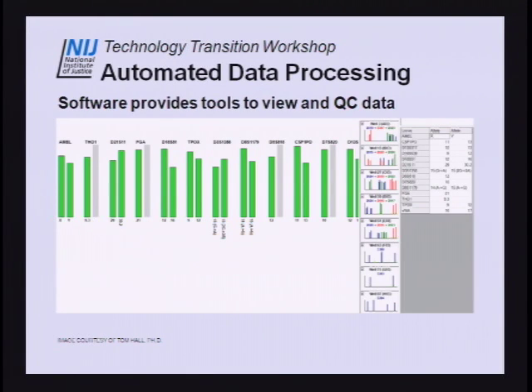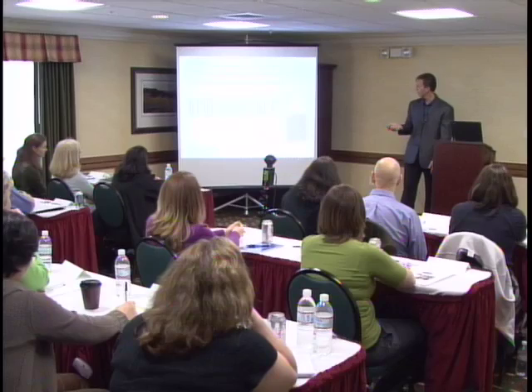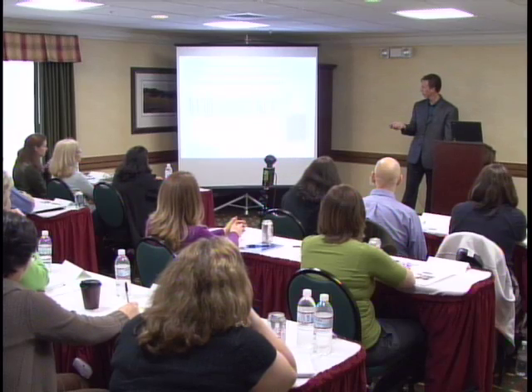There's an interface similar to the mitochondrial interface, except with some differences, because it's a different kind of analysis. You get kind of a cartoon of the alleles that have been assigned, a summary of them. I'll get into this in a minute. You'll see that these look different. This one says 15 with a G to A polymorphism relative to the reference. And there's a few of those. You'll see a lot of them actually as you go through the data.